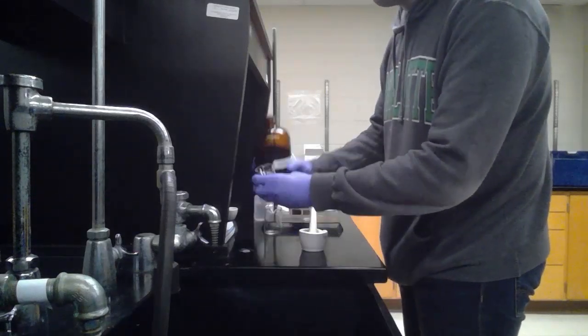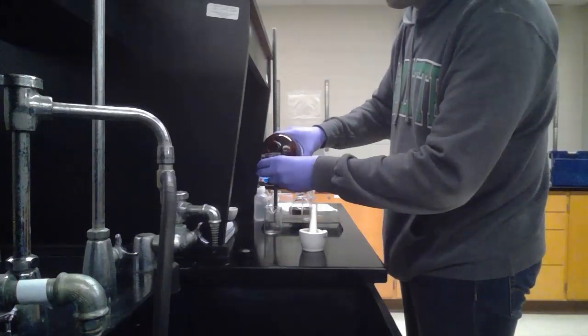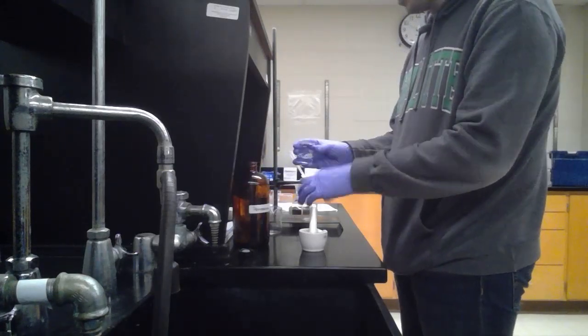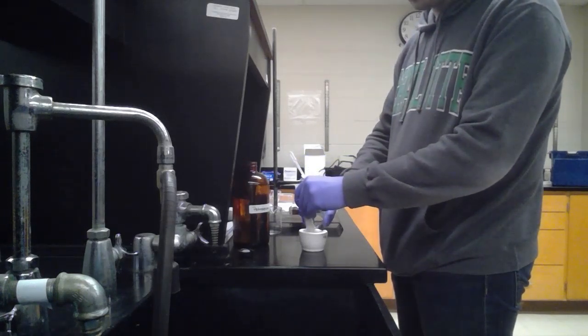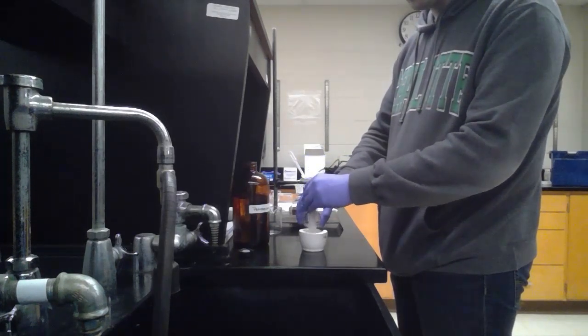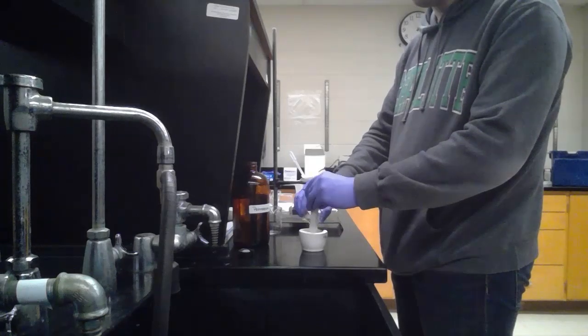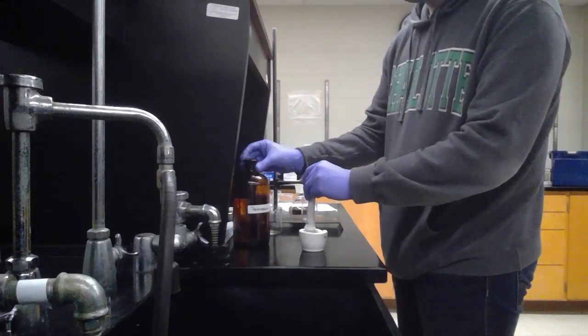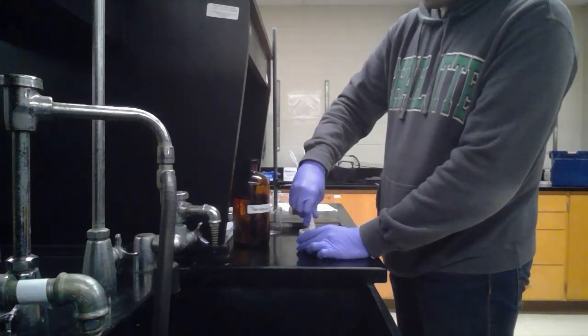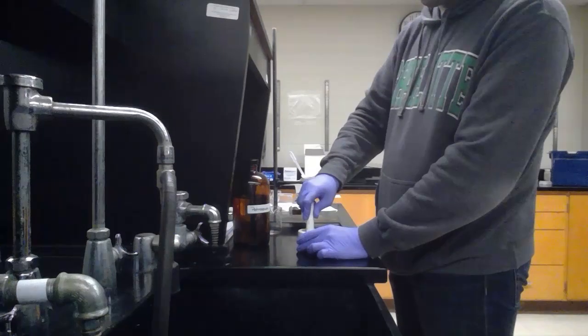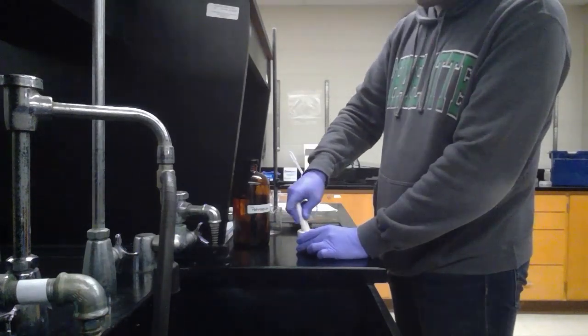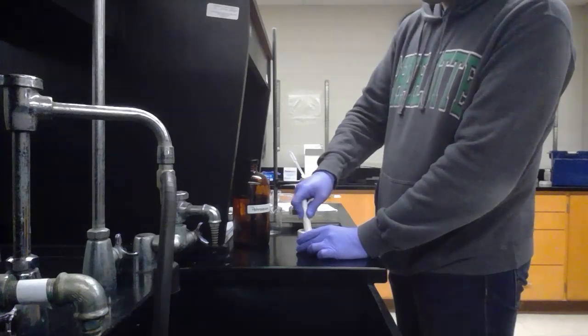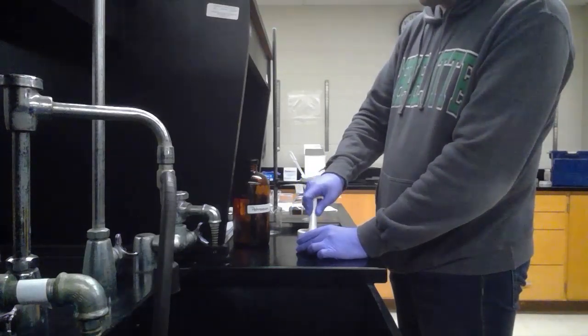I'm just going to pour 20 milliliters in this little beaker here. Then we'll take that and pour it over. I'm just going to rinse off the pestle with it also because I was grinding stuff up, and you want to make sure that you get as much as you can. After you do that, you're going to carefully crush these up in here so that you can get as much of the fat from the chips as you can into the solvent.